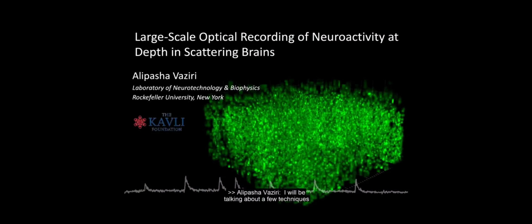I will be talking about a few techniques that we have recently developed in the lab that are aimed at recording large-scale neuroactivity in a volumetric fashion in the scattering rodent brain. As you heard from previous talks, the standard tool for recording neuroactivity in the scattering brain is 2-photon scanning microscopy. However, I want to highlight some of the limitations associated with this technique if it's applied to volumetric acquisition.